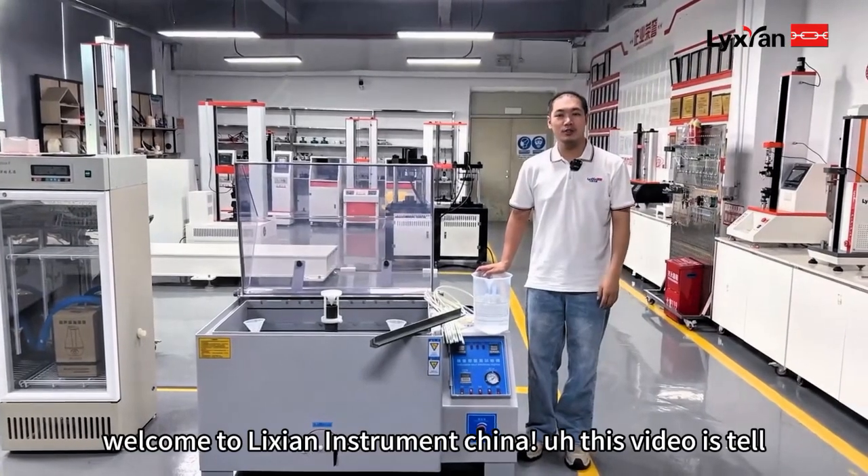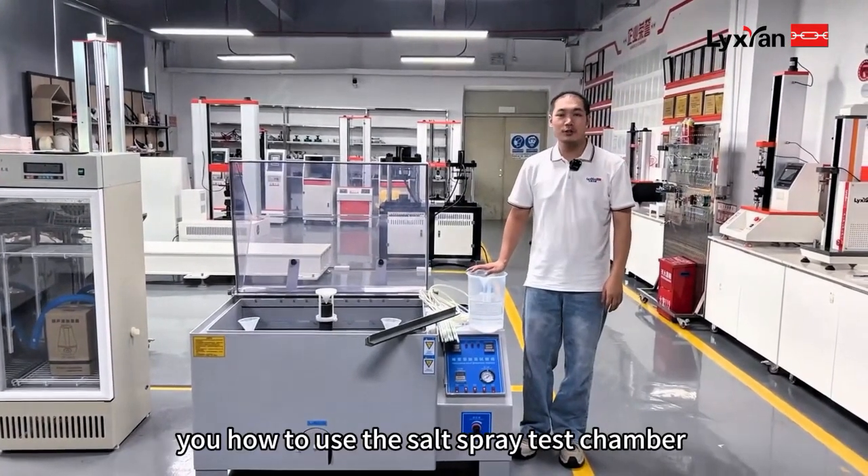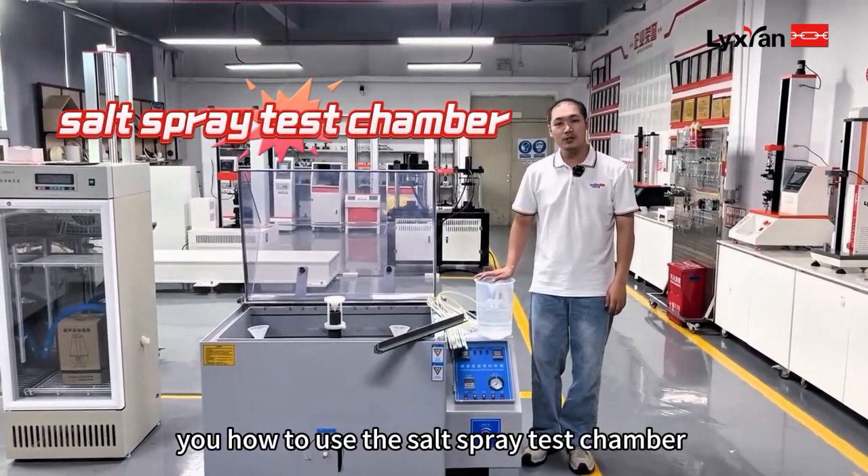Hello everyone, welcome to Nichian Instrument channel. This video is going to tell you how to use the salt spray tester chamber.